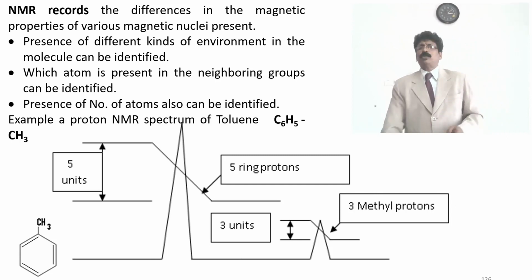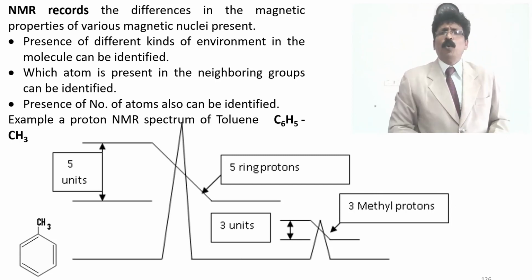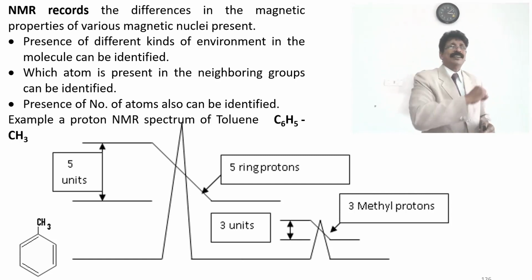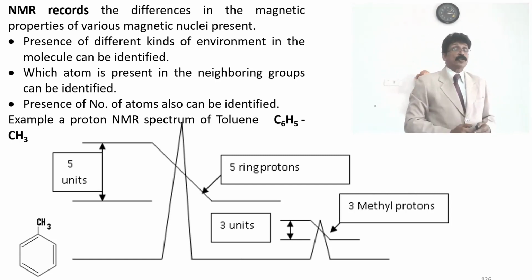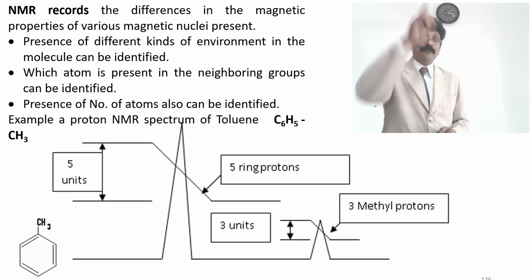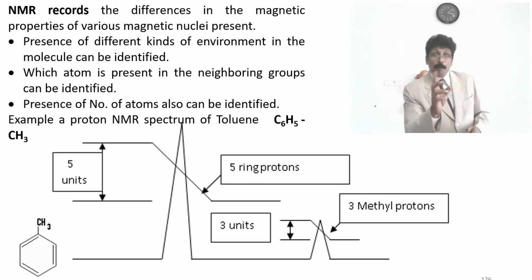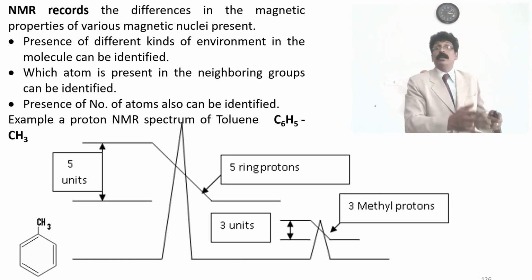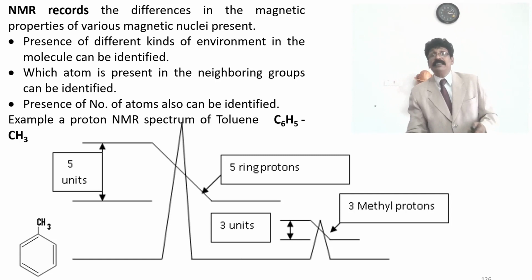So these types of peaks will give you the height of the peak and the width of the peak and the length of the peak, which gives the number of hydrogens present; the number of atoms present can also be identified. See that 5 ring peak and the position where it is, like x-axis, y-axis, you will get the transformed radio frequency versus the energy.